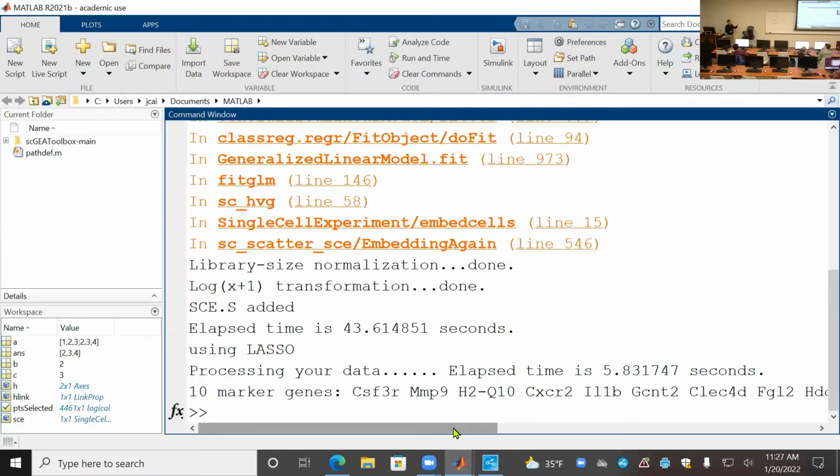Okay, this 10 marker genes list is here. And that's exactly the knowledge, the database search you want to use, to see, okay, I will use these marker genes to search my database and find what this is most likely to be. I still don't know because I don't have knowledge of this. Is that NK cell maybe? Neutrophil, yeah. Here we go. We have a cell biologist around us.